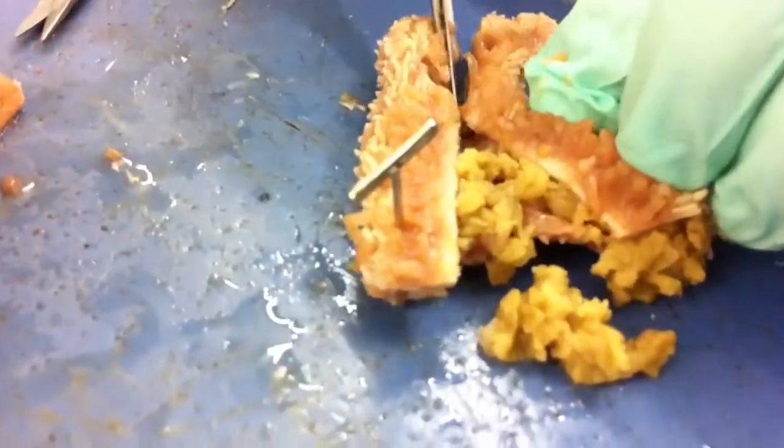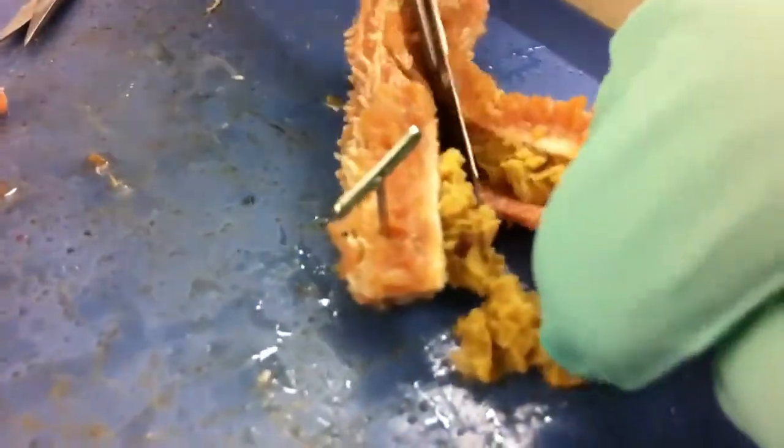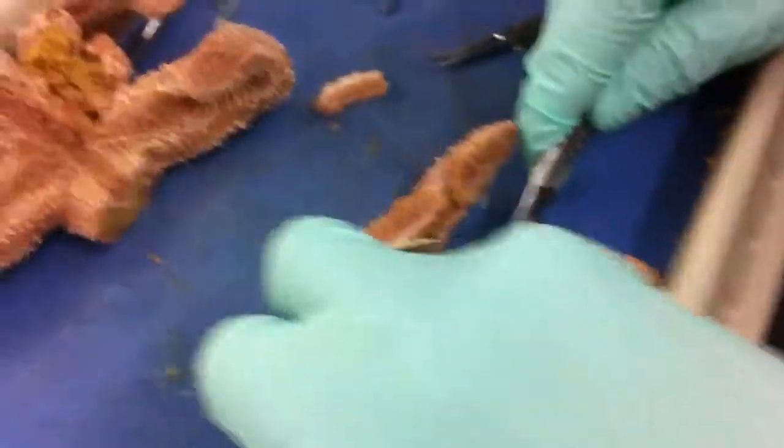Dude, it's so hot. Alright, so we're just going to pin this open. I'm going to pin this open.